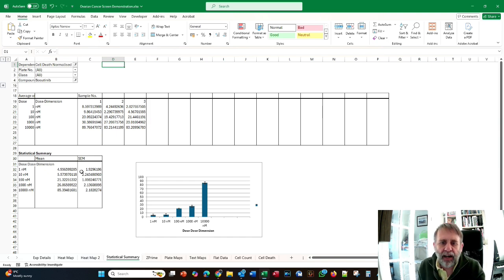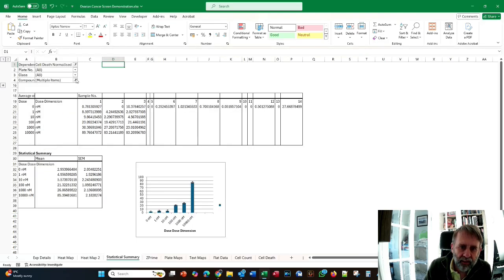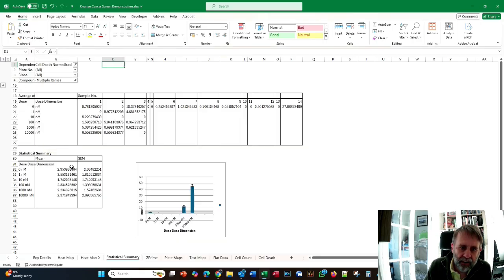Okay, but in fact, I also want the 0 dose in every single table. So what I really want is to also switch on, using multiple selections, DMSO as well, like this. Okay, and then literally I want to be behind the scenes going from one to another drug while keeping the DMSO value fixed, so that that's the 0 dose for all the different graphs.